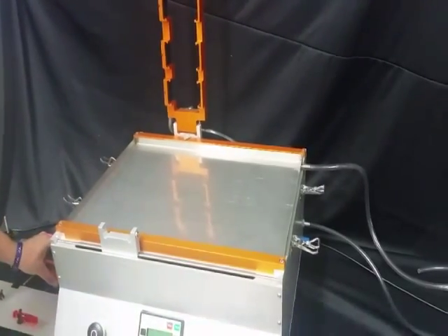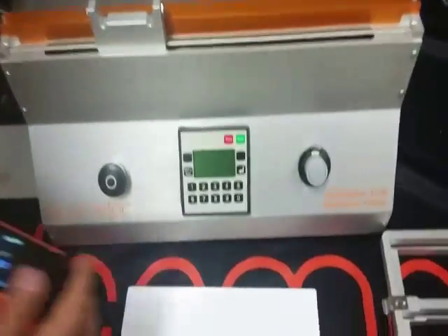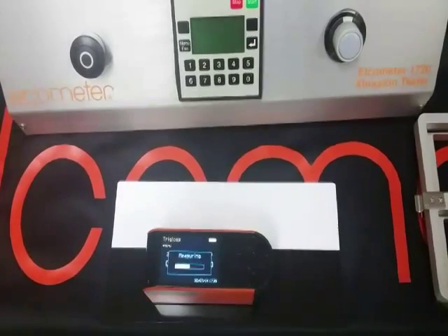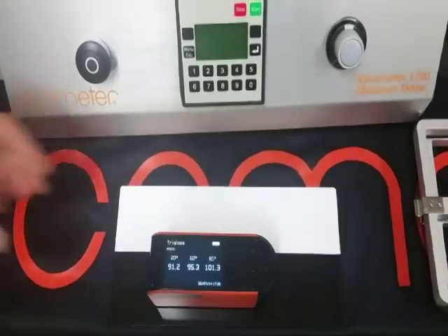We are going to be using the Elcometer 407 Gloss Meter to take a reading of the test panel before and after. Using the 60 degree angle, the test panel reads at 95.3 gloss units.